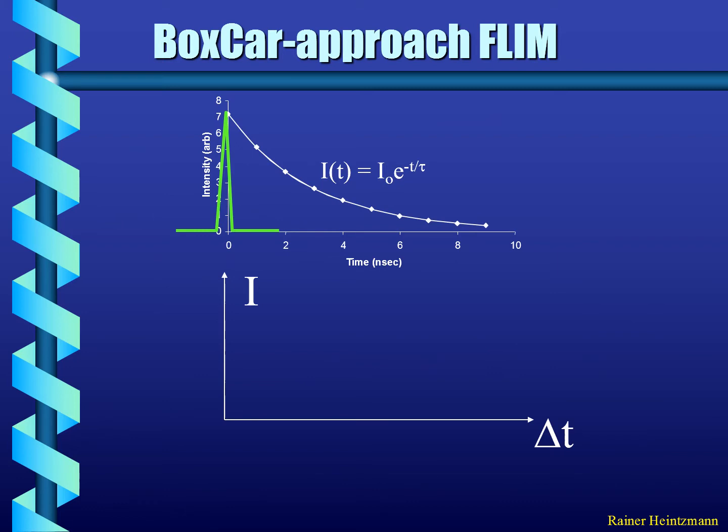So now we are asking, how can you actually measure such a fluorescence lifetime decay curve? If in reality the fluorophore decays like this, or the measured photons decay in brightness over time, over the time span of a few nanoseconds, the question is, how do you measure that? One approach is that you have some way to, for example, gate your detector. So that would be like this.